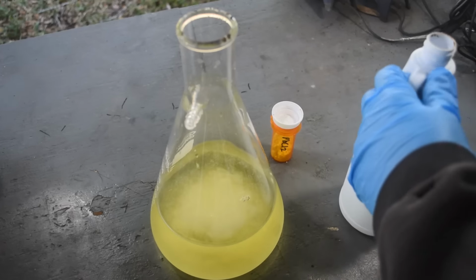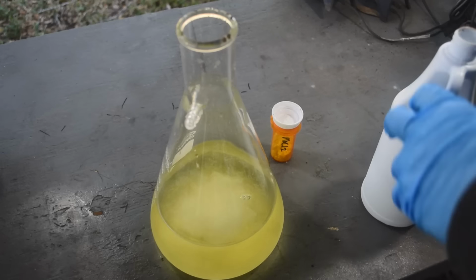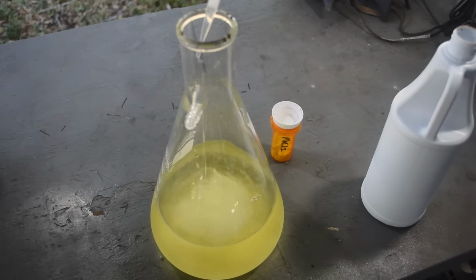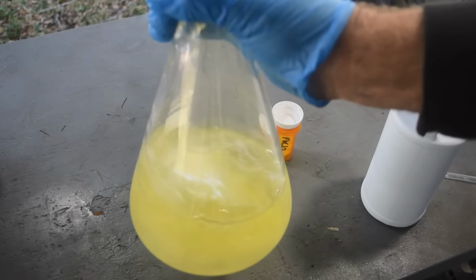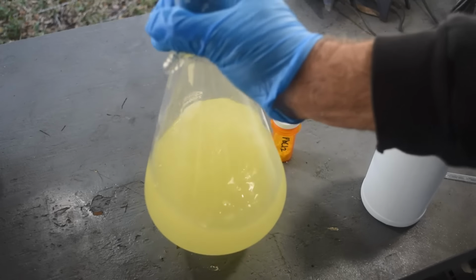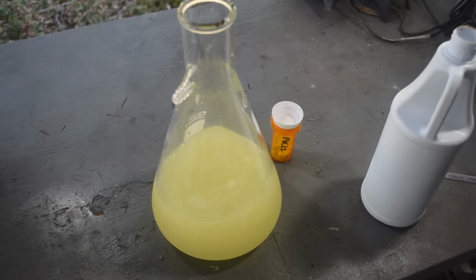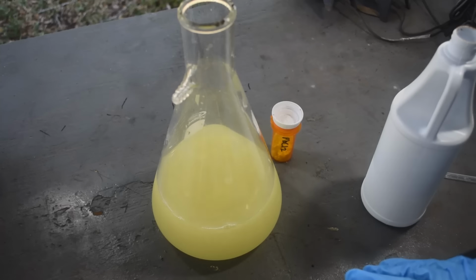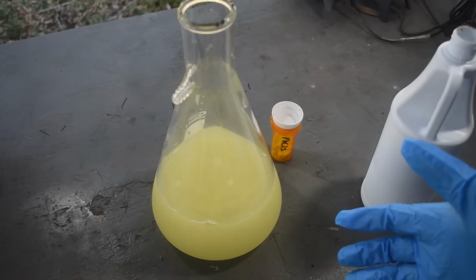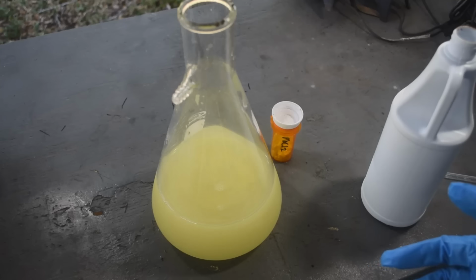So I'll bet that is lead. Somehow, some way, we extracted just a crap ton of lead out of those IC chips. I'm going to put about another milliliter in just to be safe and swirl this around. And yeah, look at that. Look how milky that's gone. Yeah, I guess it was lead. Okay. Well, I'm going to let this sit here for a little bit, and I will get set up to filter it again. I may gravity filter it with just a funnel with cotton stuffed in the base of the funnel.